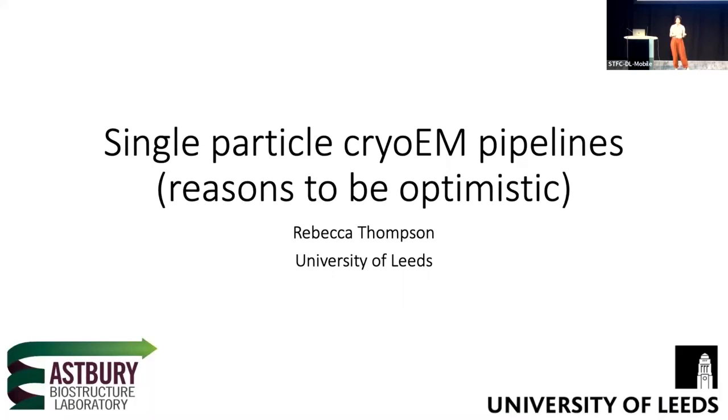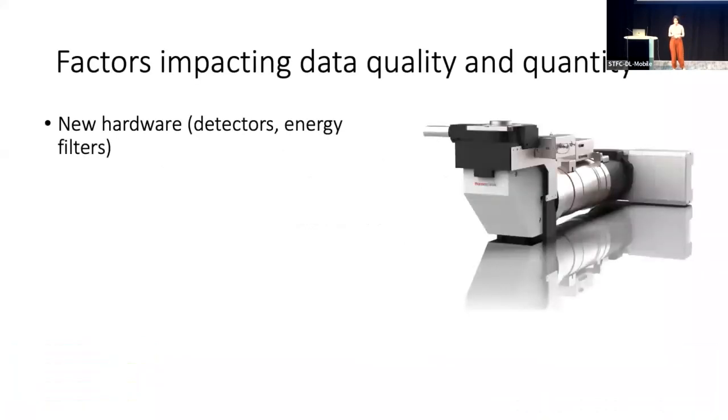So we had our 2 Titan Krios installed back in 2016 now. And looking back at how things have changed, an awful lot has changed, and actually specifically in the last 6 months we've had a large number of hardware and some software tools come online, which I think are really changing the face of single particle data acquisition. So thanks to Karen yesterday for giving a lovely talk and introducing some of these things already to you.